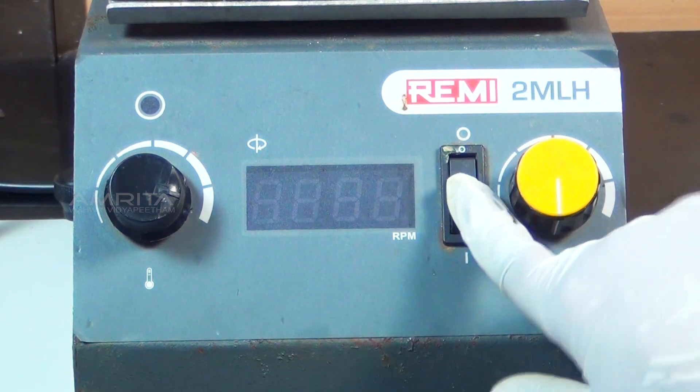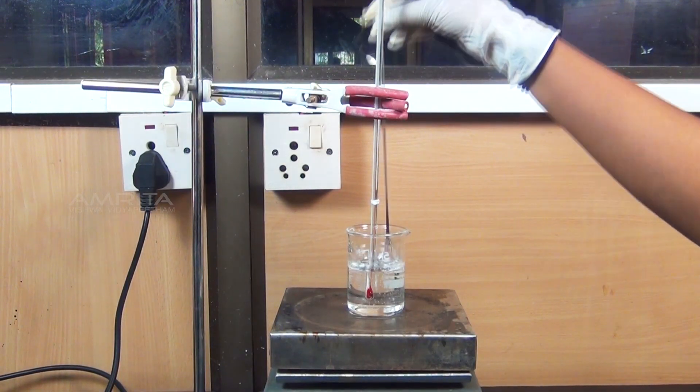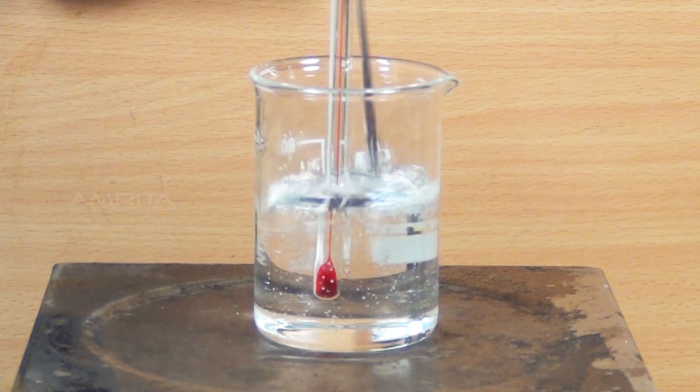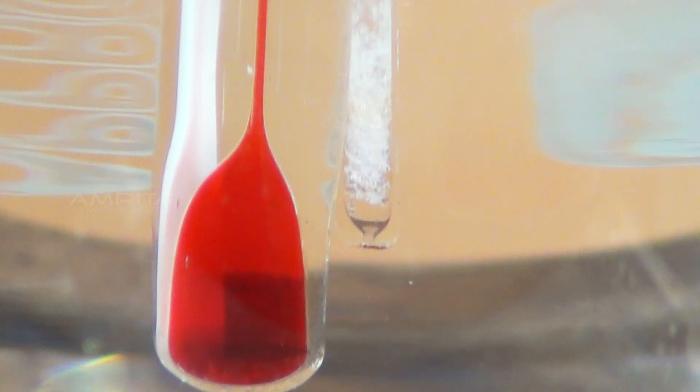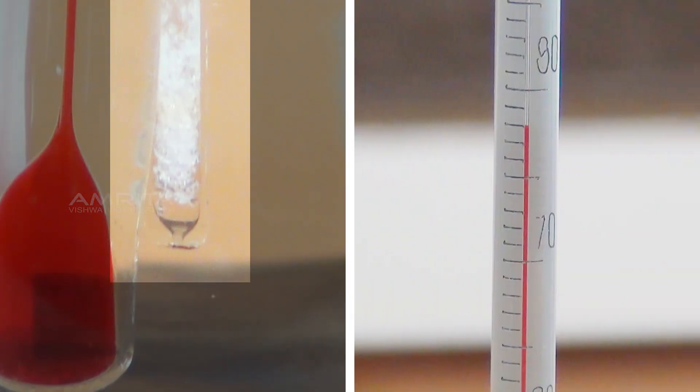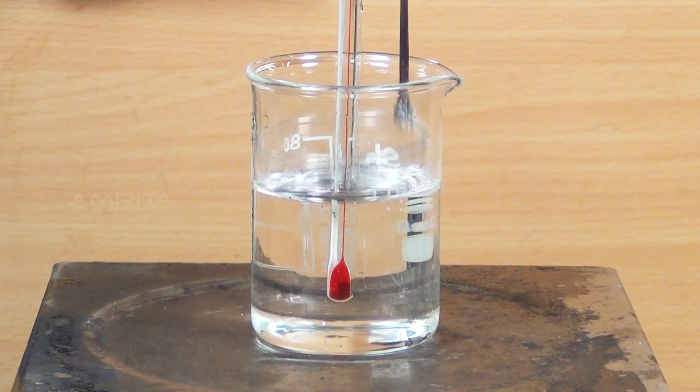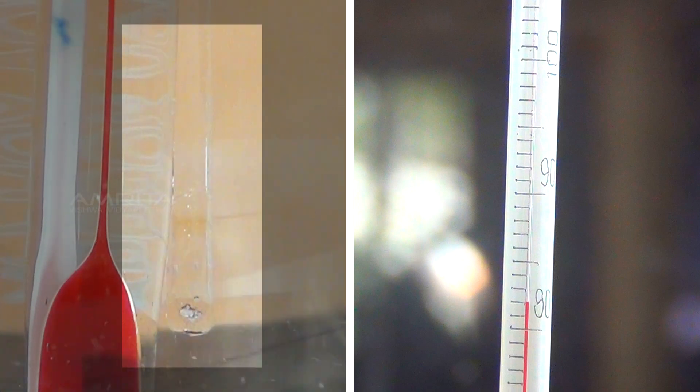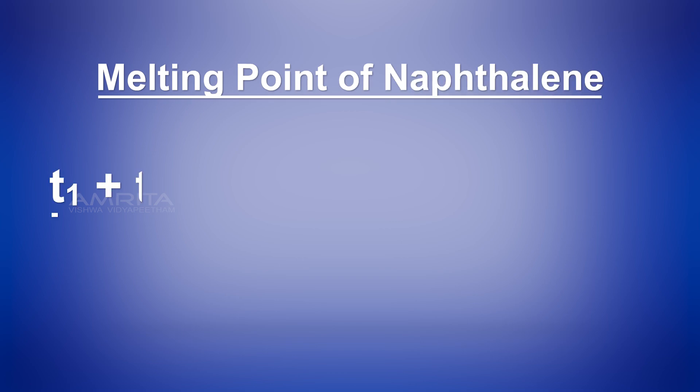Start heating the liquid paraffin bath slowly and stir the bath gently using the stirrer to ensure uniform heating. Note the temperature T1 when the naphthalene starts melting. Continue heating and note the temperature T2 when the naphthalene in the capillary tube is completely melted. The average of the two temperatures T1 and T2 gives the melting point of naphthalene.